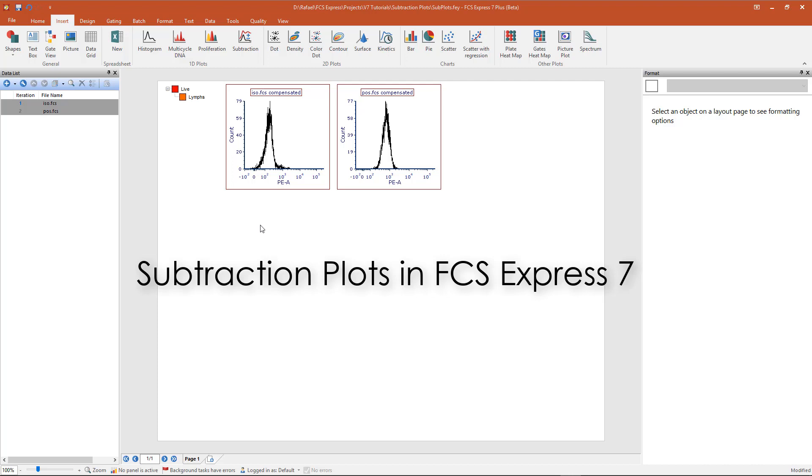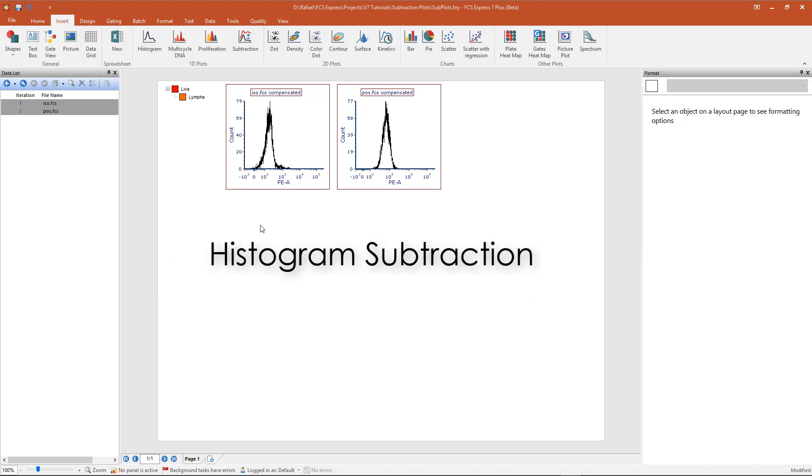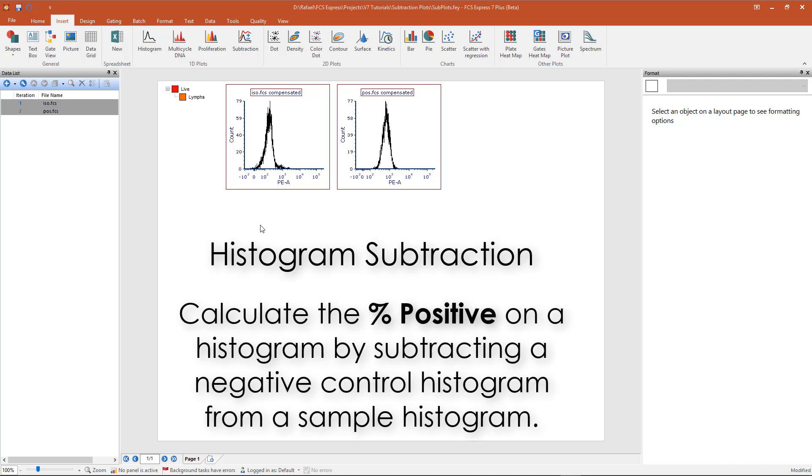Subtraction plots, new to FCS Express 7, allow you to perform histogram subtraction and calculate the percentage positive on a histogram by subtracting a negative control histogram from a sample histogram.